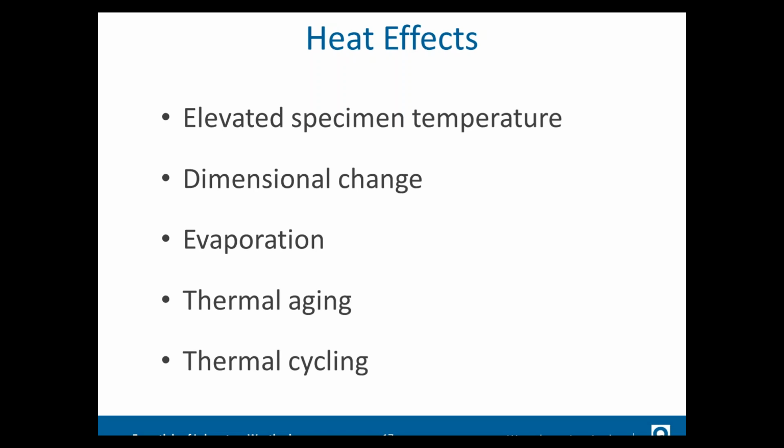Additionally, for materials that have solvents in them or anything like that that would hold them together and keep their durability, evaporation is another important effect of heat.